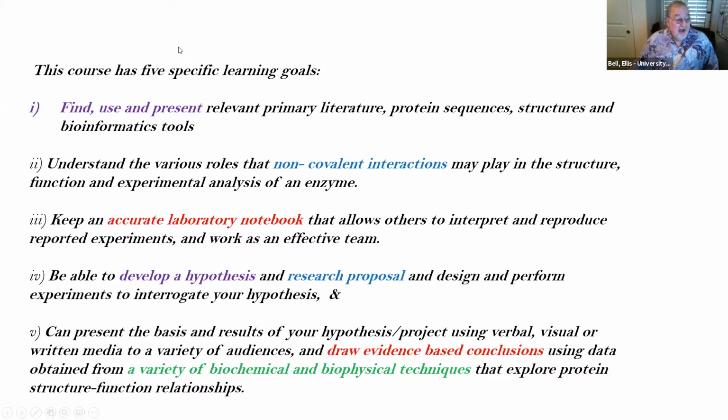The lab course I teach had 5 specific learning goals, and these are probably fairly typical of lab courses. They talk about using the primary literature, some conceptual focus, which in my case was non-covalent interactions, and skills such as keeping an accurate lab notebook.